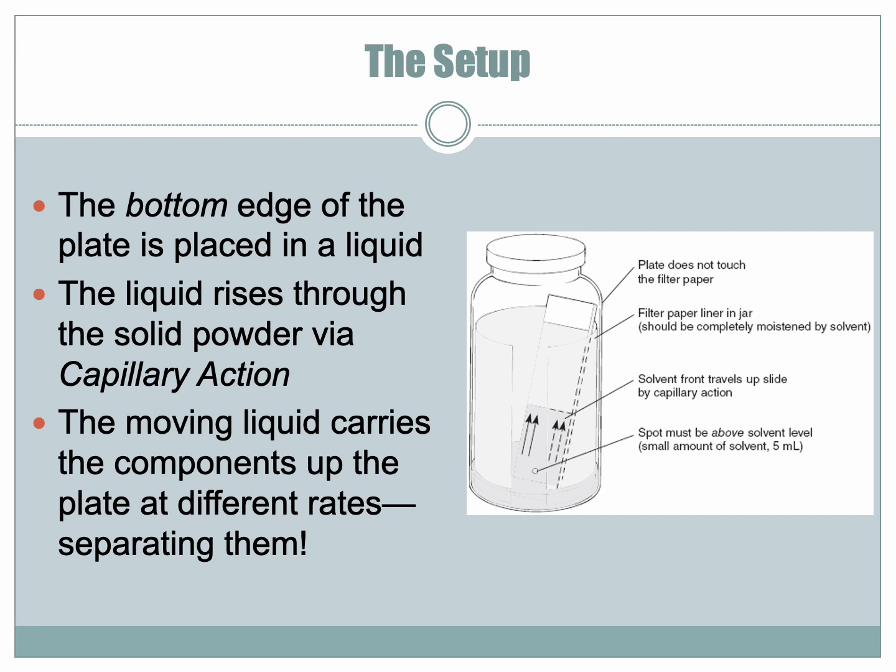The idea is you have this filter paper on the inside of the jar that's soaked in solvent, and it gives the solvent more surface area to evaporate, because we want the chamber to be filled with the fumes of the solvent, so that there's a large amount of gas phase in the chamber. That's also why we cover the chamber. We cover it because we want there to be a high concentration of gas from our solvent inside the chamber.